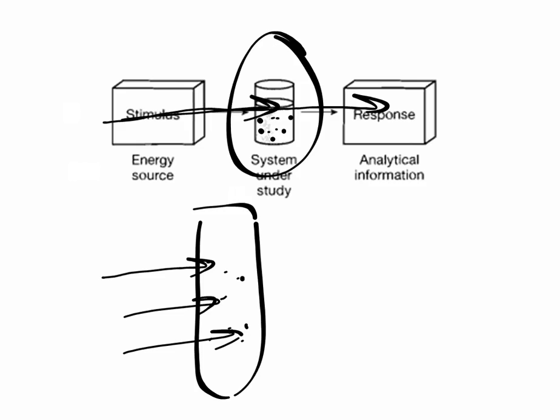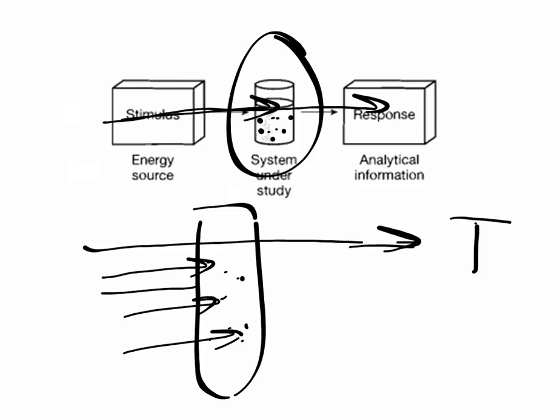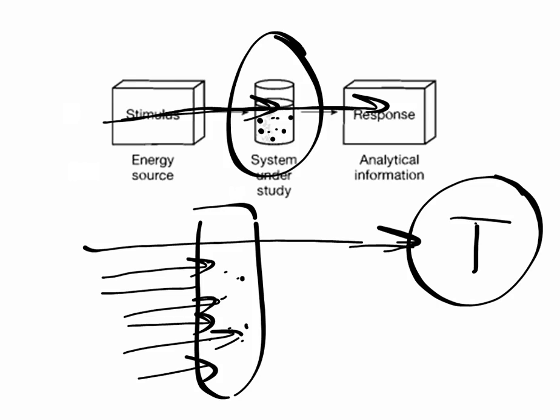So what's transmittance? Transmittance is when the light passes all the way through. That's T. Absorbance is when the light doesn't make it through the cuvette because it's running into molecules of dye, since we're doing Gatorade dye tomorrow. We measure transmittance, the amount of light that passes through, by putting the sample into a spectrophotometer. That's the whole point.